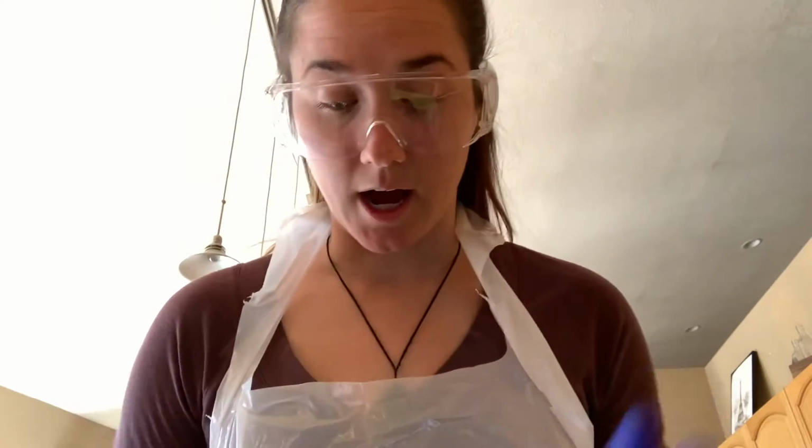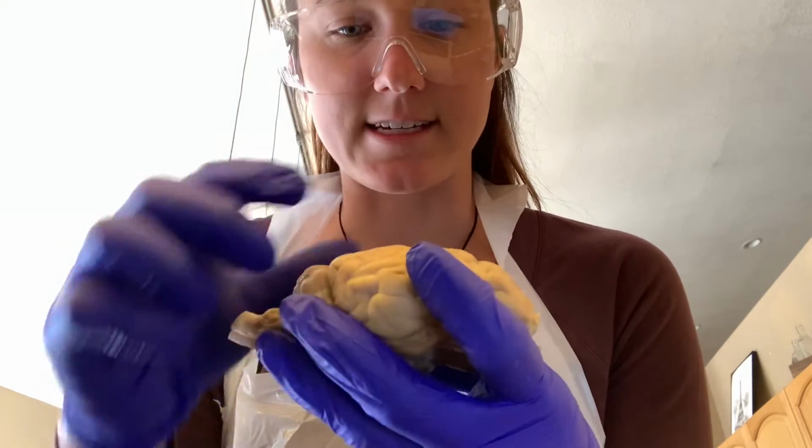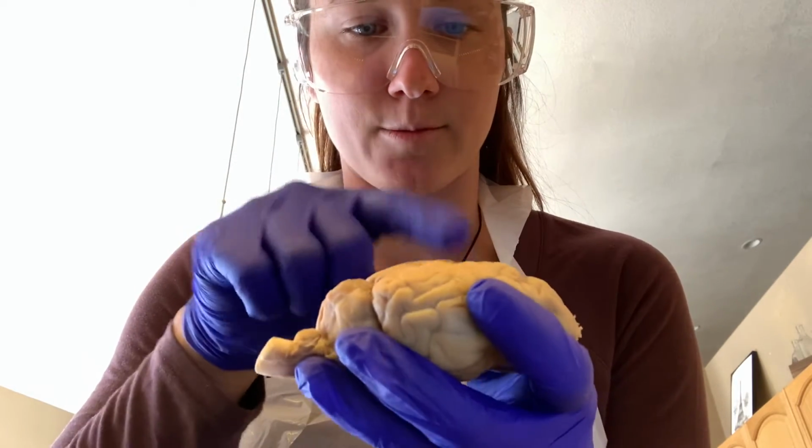Good afternoon, my name is Alexandra Barker and today I dissected a sheep's brain. The sheep's brain here is a very fragile organ and it has the texture and the consistency of firm tofu.